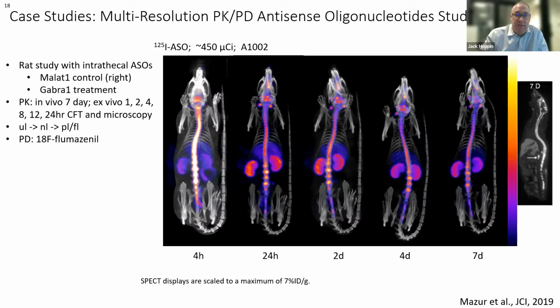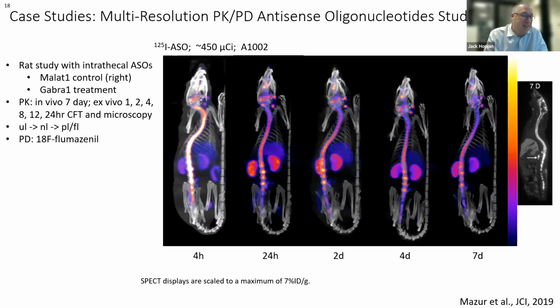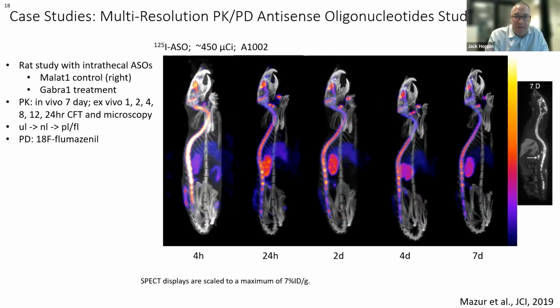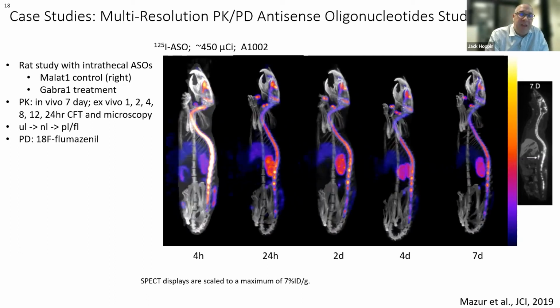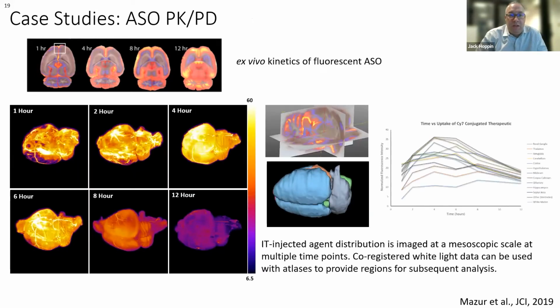And the next activity: I've been accused of showing too many spinning mice, and that's totally fine. I still like them. Now, in this case, we resected brains, sectioned them and imaged them, taking down rats at different time points. There you see the fluorescently labeled oligo as a function of time in 4 different rats and a cross section. We get the whole brain.